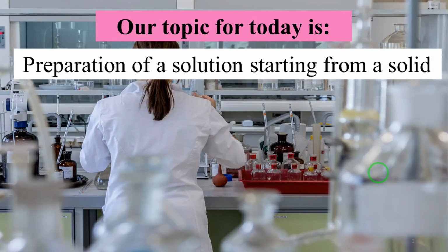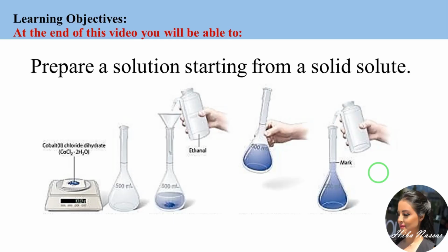Our topic for today is about preparation of a solution starting from a solid. At the end of this video, you will be able to prepare a solution starting from a solid solute.